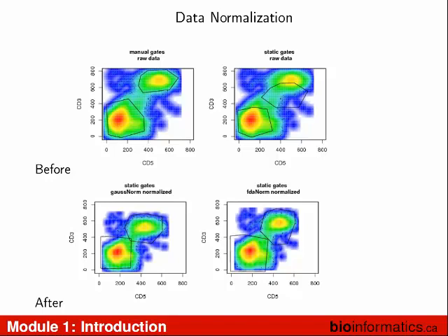So the question then is, how is data normalization a more straightforward way of normalizing as opposed to referencing FlowJo movable gates? So that's all we're doing. And so the question is, how is this different than moving your gates in FlowJo? In FlowJo, you're doing it by hand. Now, we're not.